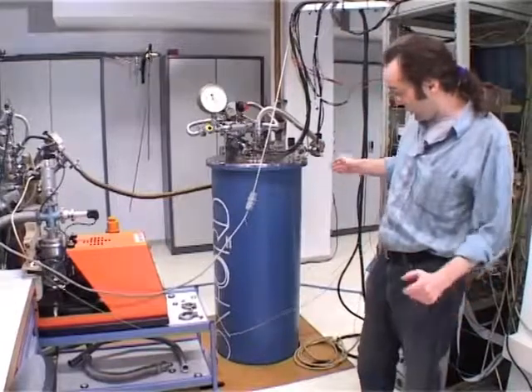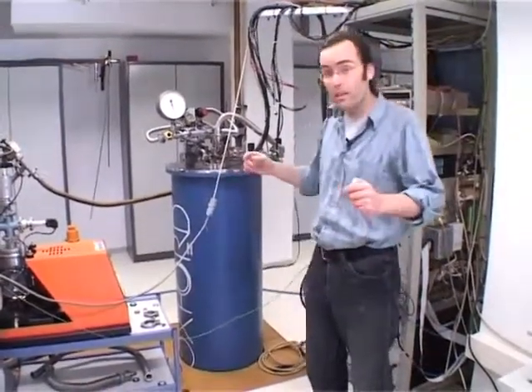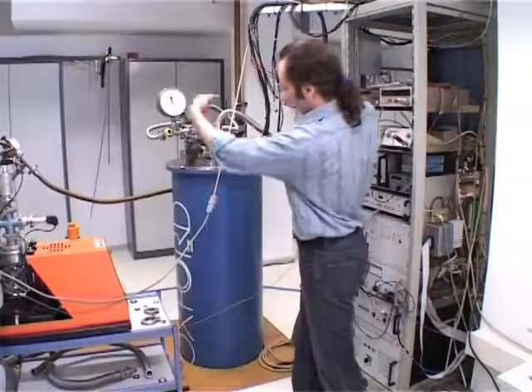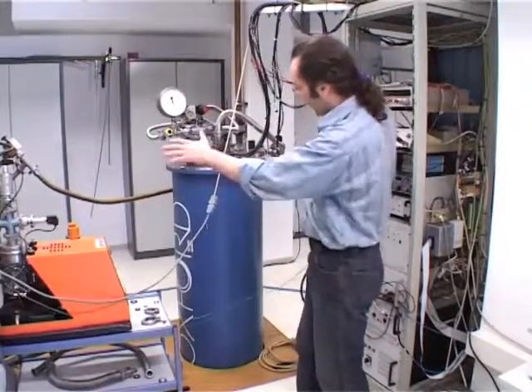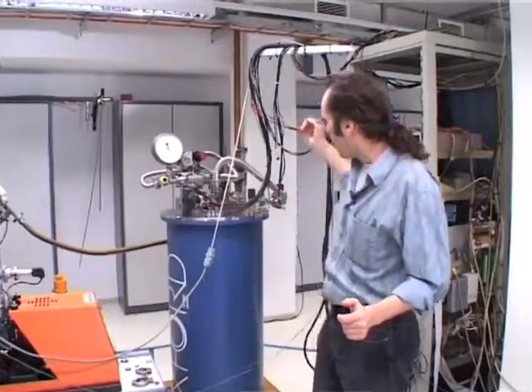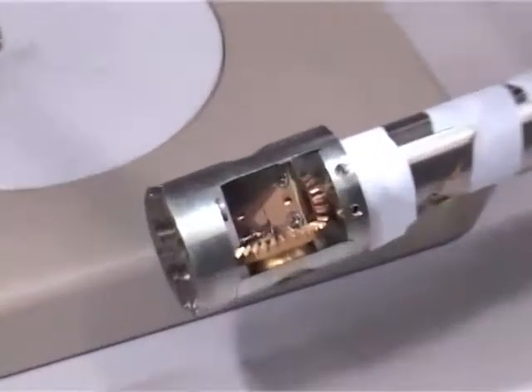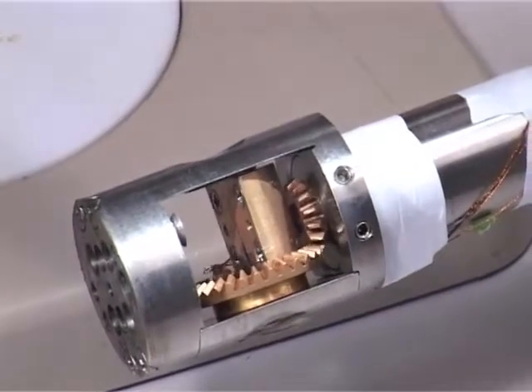This cryostat is equipped with a Helmholtz split coil magnet. So there are two magnets, and the magnetic field is horizontal, which makes it easier to make an anisotropy measurement when we rotate the sample this way inside the cryostat. You can see we can make this rotation around this horizontal axis.